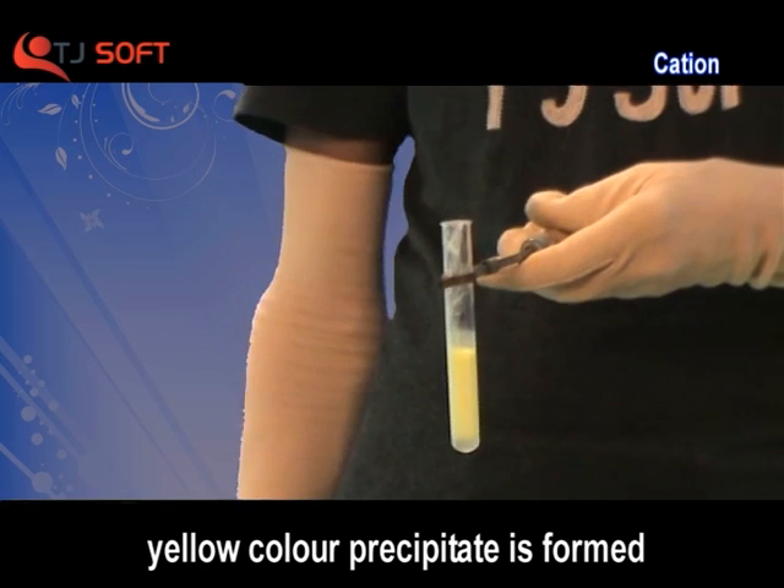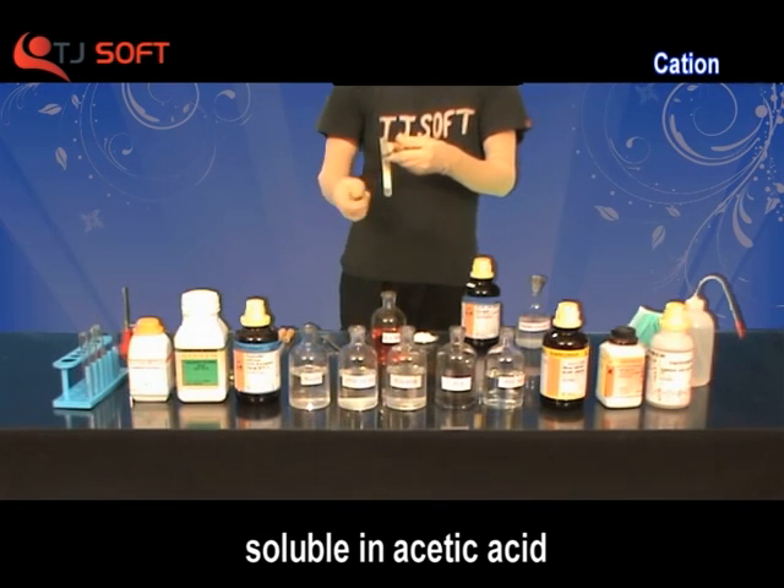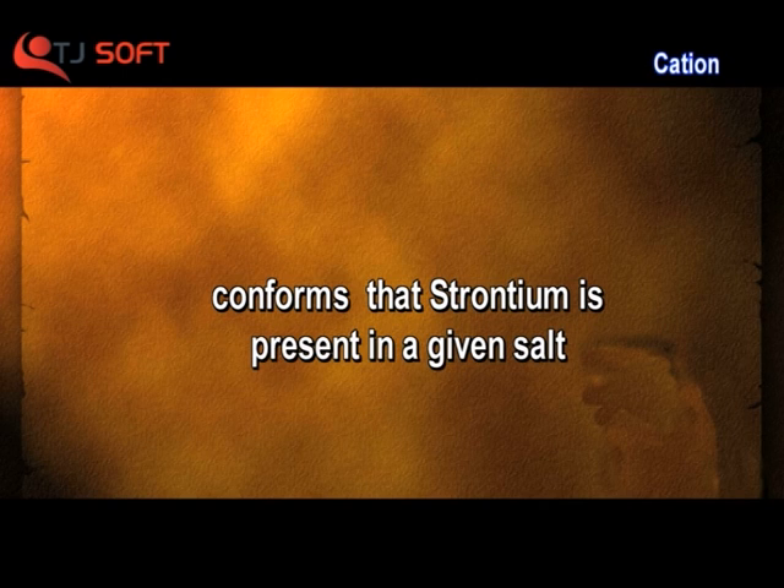A yellow precipitate is formed, and this yellow precipitate is soluble in acetic acid. This confirms that strontium is present in the given salt.